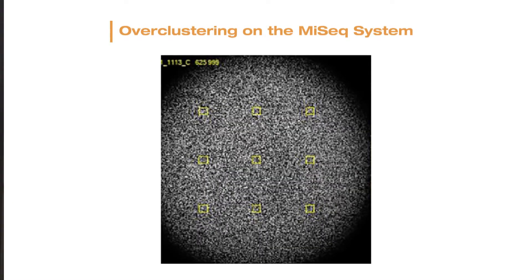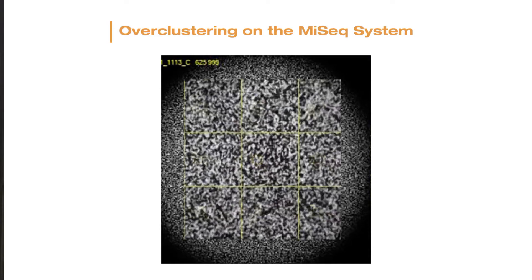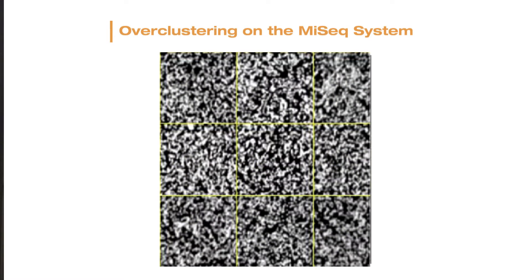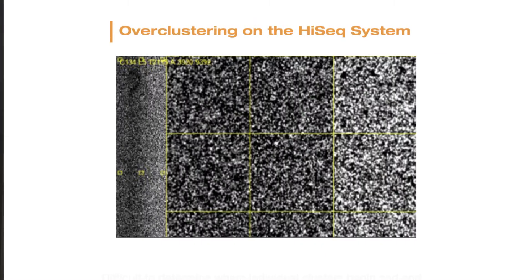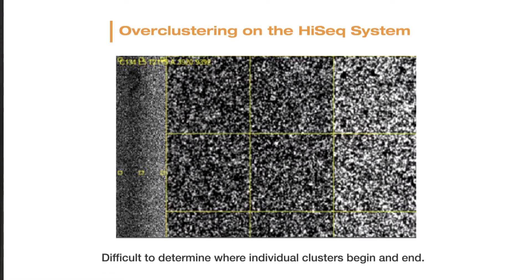Over clustering increases signal brightness, which makes it difficult for the instrument's optics to find the correct focal plane. This can cause poor cluster identification, known as template generation, poor registration, and other image analysis issues.